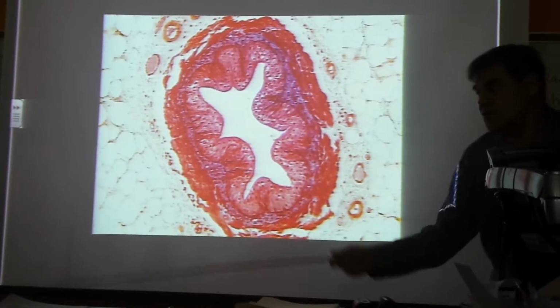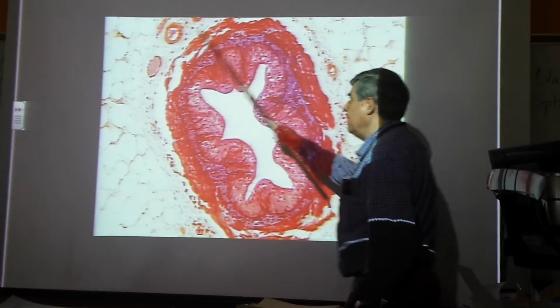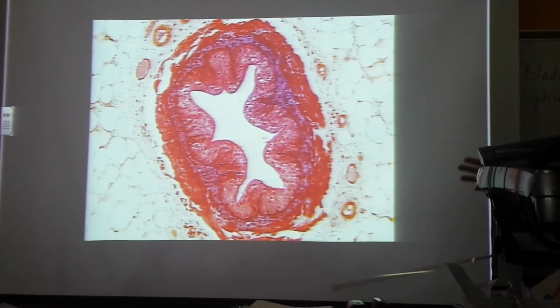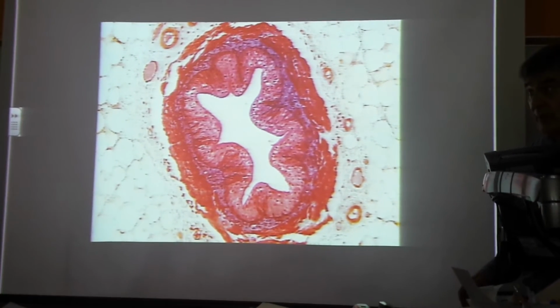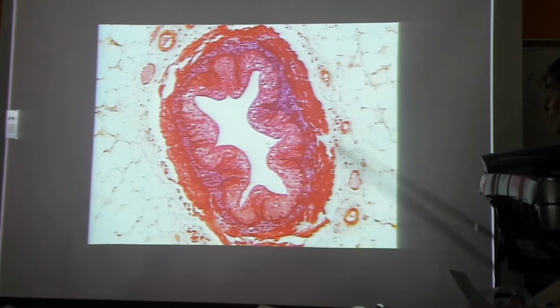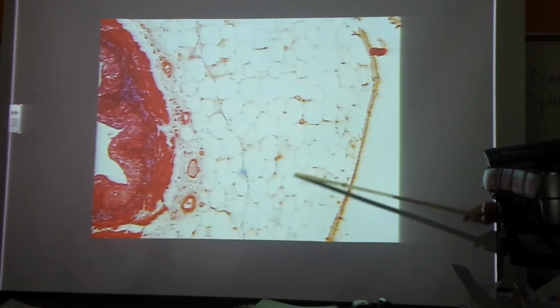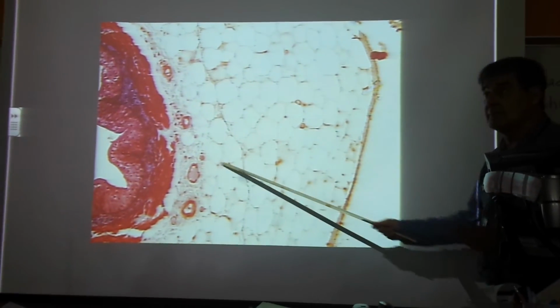Okay? Superficial to that, we've got this layer, it's kind of gray, with a lot of blood vessels in it, you can see here. This is called the adventitia. It's connective tissue on the outside of the organ wall. We saw adventitia in the part of the GI tract outside the abdominopelvic cavity, remember, like the esophagus. Adventitia again. Then out here, we've got another type of tissue. What is this? Adipose. That's adipose. It's a fatty sheath.